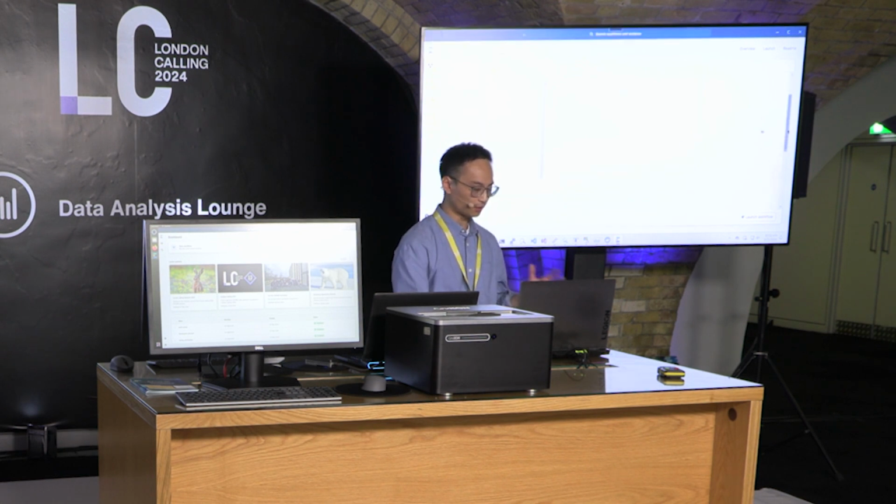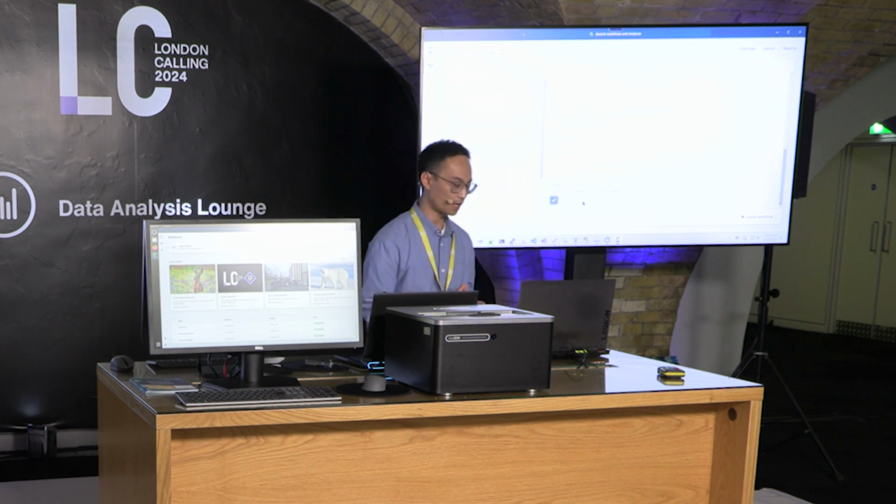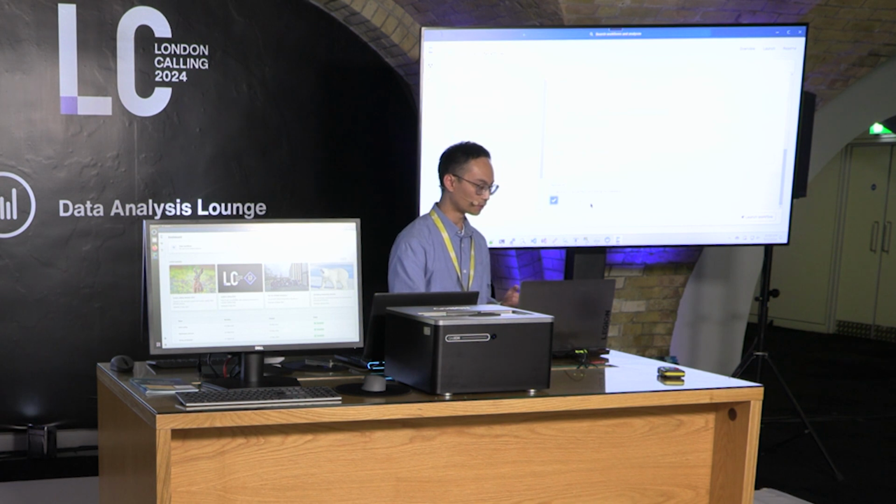Now, there are a few other quality filtering parameters that we can play around with, but I'm not going to touch them here. But I'm going to scroll all the way down here and disable genome polishing. Normally, I don't like to do this, but simply for the interest of time, in order for us to speed up the time to results, I'm going to disable genome polishing.